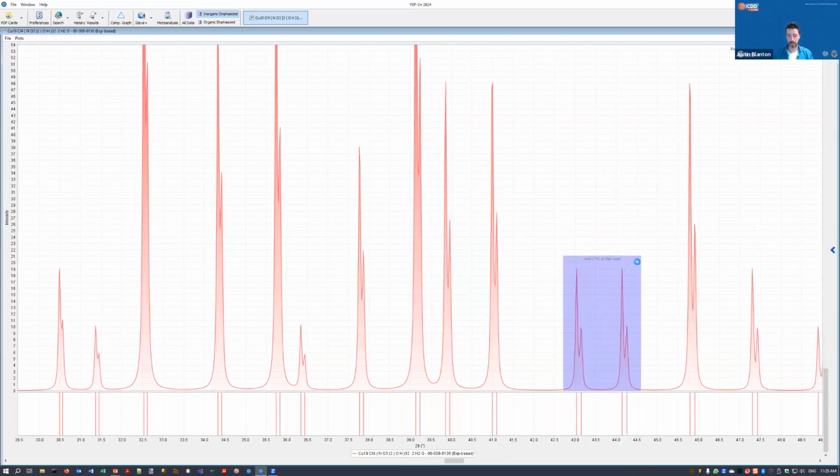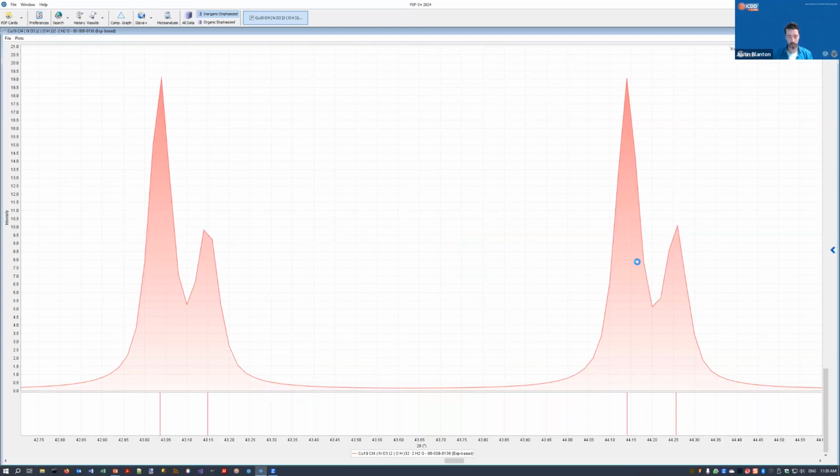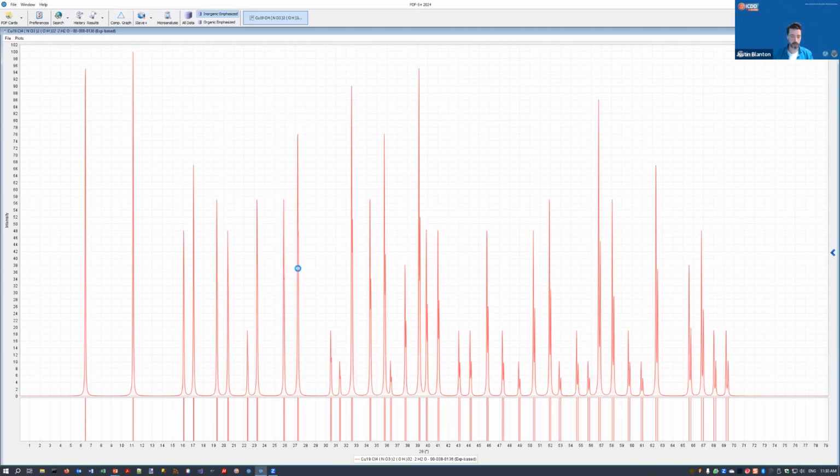And this gradient fill gives you a nice way of popping the color underneath the area of the diffraction pattern. And it gives you a nice way to just kind of show you how the area is. And particularly when you have multiple diffraction patterns when you're doing analysis, it's a much nicer way of actually viewing the diffraction pattern.